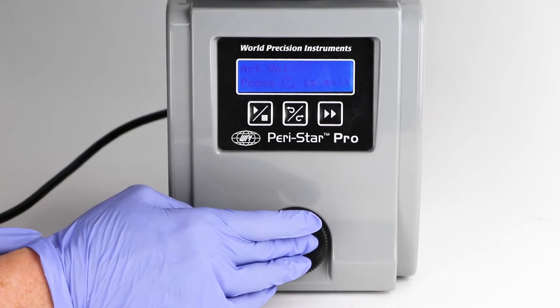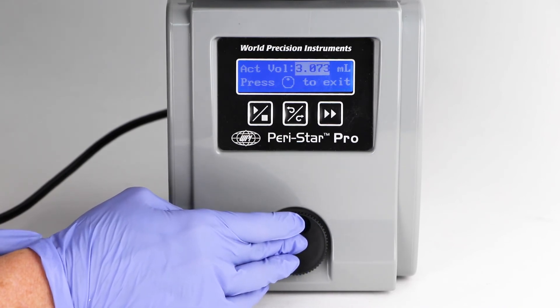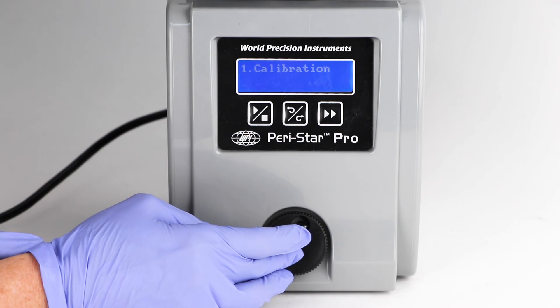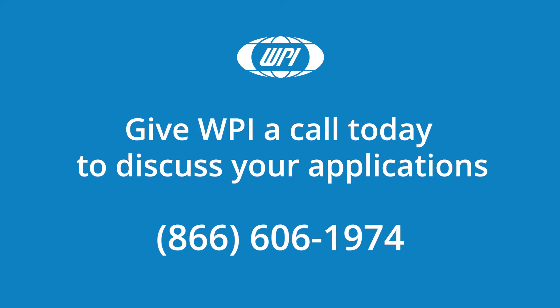Toggle to the act vol menu item and press the control knob. Rotate the knob to enter the calibration volume which was actually pumped during the calibration test. Press the control knob to return again to the main menu.